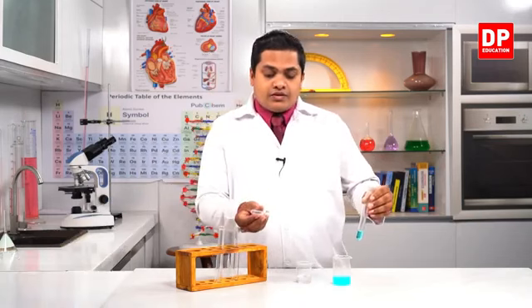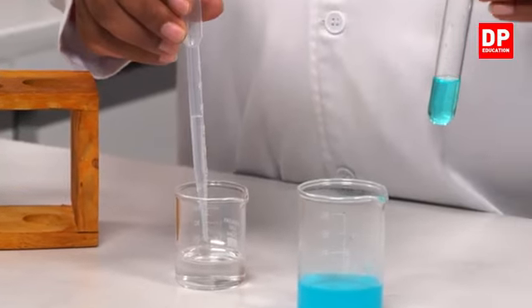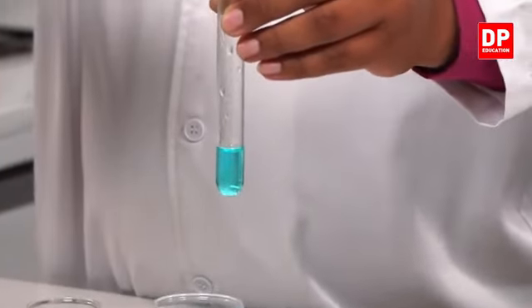Right? So this is the dropper. So I'll use the dropper and we'll add drop by drop to check the observations.